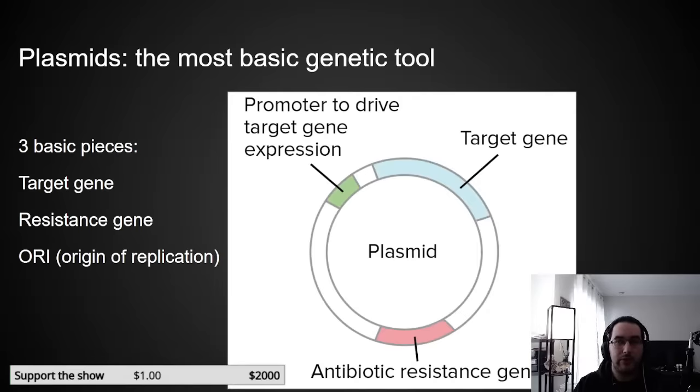But basically the way this works is it's one of those chicken and egg things, where you have to have a modified starting organism in order for this to work. But in the case of yeast, for example, you can go in and break their ability to synthesize some crucial chemical. Sometimes it's an amino acid. Sometimes it's a nucleotide. It's something inherent that they need to survive. And if they don't have it, they don't live. So the way that you break the gene in, let's say, the yeast genome, so it can't produce adenine, for example, then in your plasmid, you include a functional copy of the adenine synthase gene. So this way, if the new DNA ends up in the yeast, now they're able to actually produce the missing chemical.